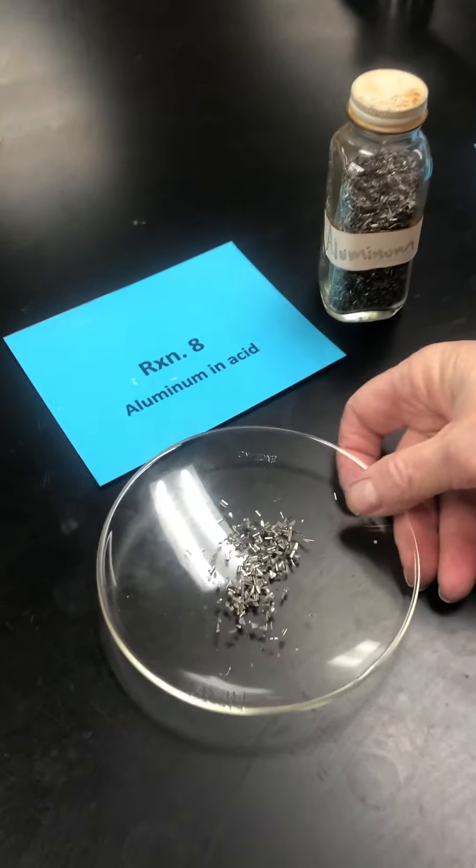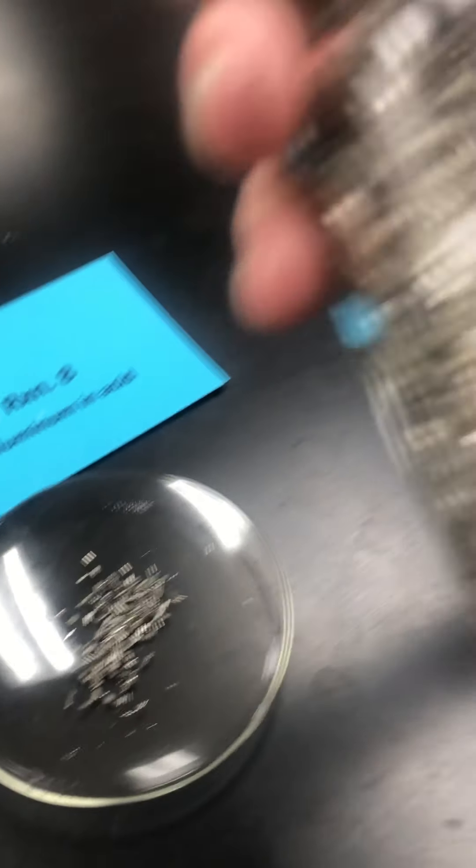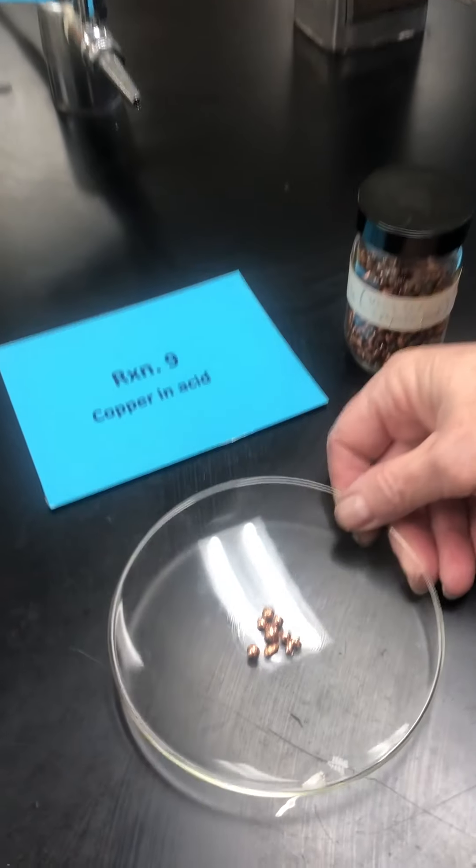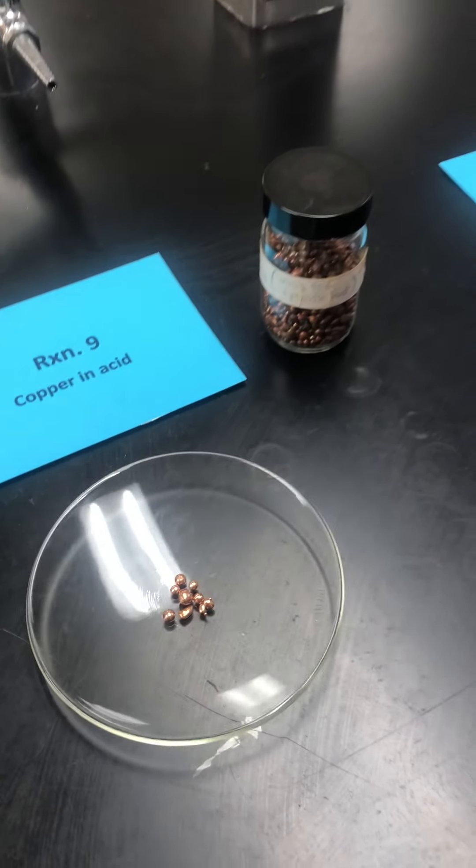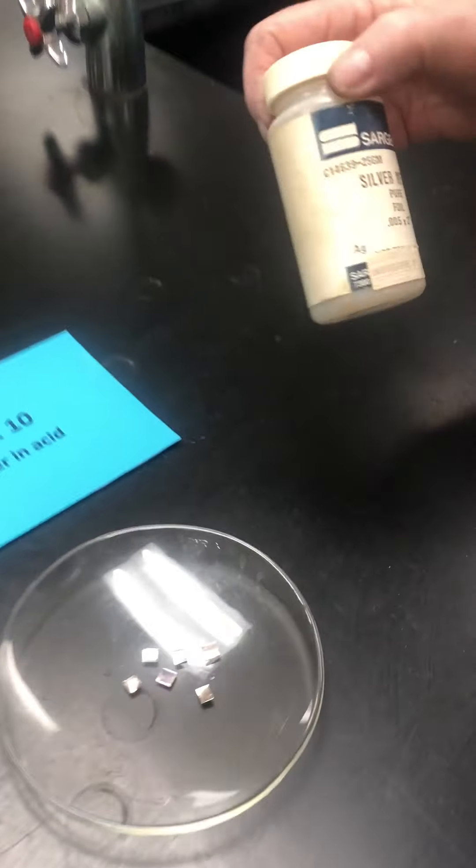Here number eight is aluminum. I have aluminum filings into which I'm going to pour hydrochloric acid. Here I have some beautiful copper that I'll add hydrochloric acid to, and here I have silver.